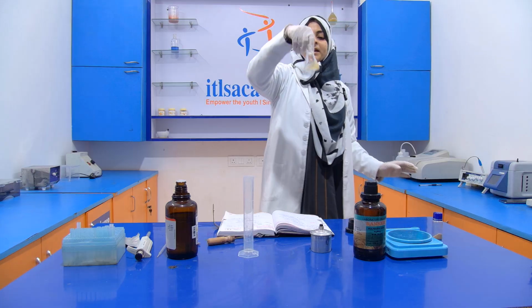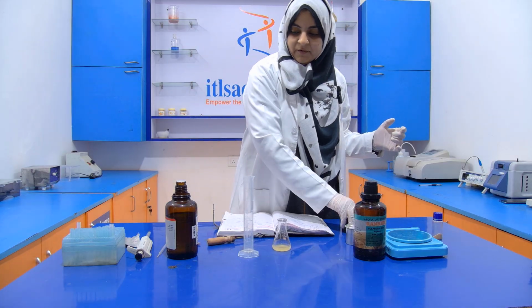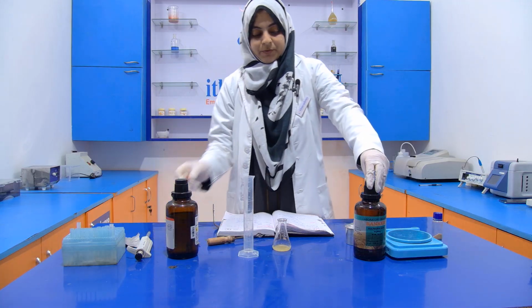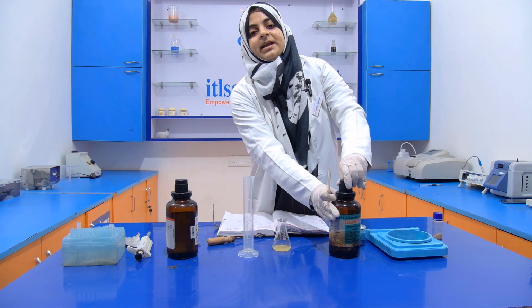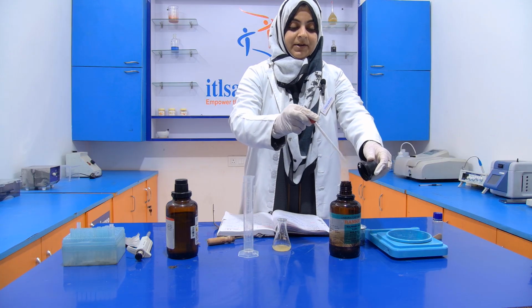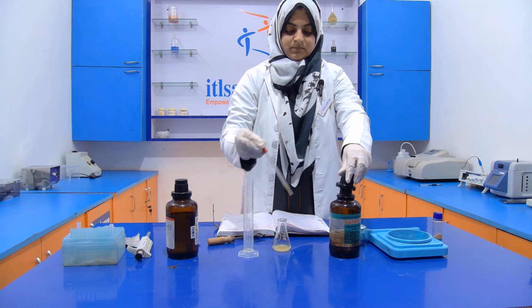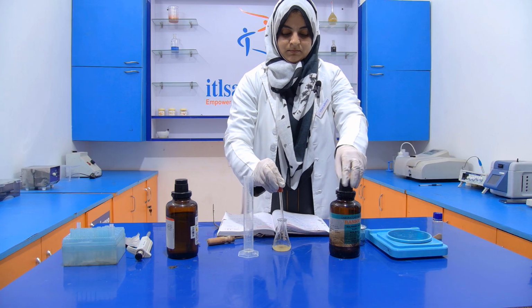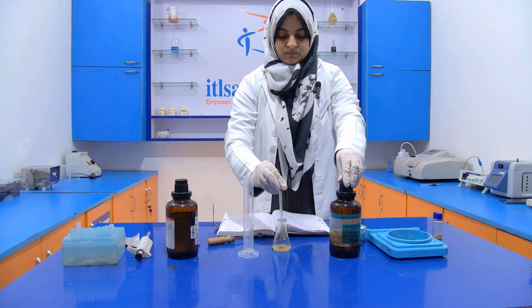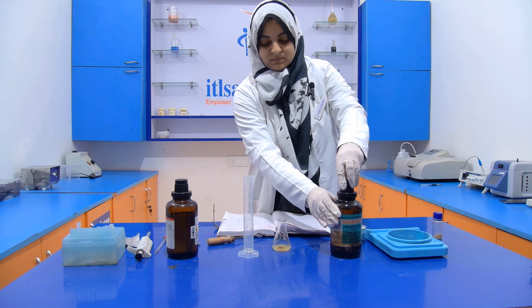Now after heating and after cooling we get this solution, and into this solution we have to add 2 drops of concentrated sulfuric acid with the help of this dropper. Now add it very carefully. Now mix it.